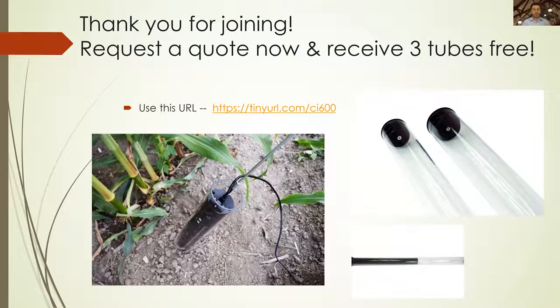When originally established, we were using a lot older laptops and older scanner technology. Since the subsequent update, since using laptops that are faster processing, we've actually seen the times decrease considerably, while really increasing the amount of scans you can do in one area. So, for example, if you wanted to do 100 DPI scans, honestly, in the work I've seen and the work of the researchers, you can get down to just a few seconds, to 10 to 15 seconds, to do a full scan. And then the higher the DPI, definitely the longer the scan is going to take, but especially with the 602, the time has been decreased.